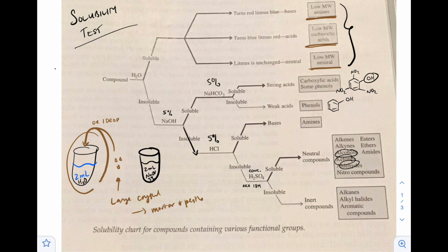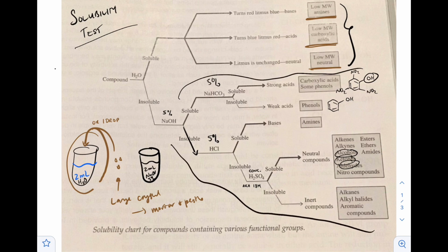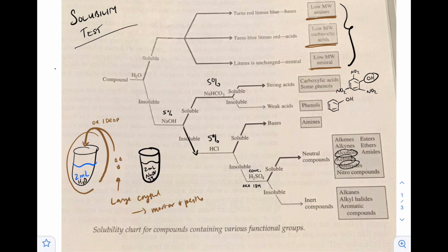I think the bulk of the information is down here, like what's going on, why do these help us identify the functional groups. And so I hope that was made clear. If you have any questions, of course, you can reach out to me. But just take detailed notes, and then when the time comes, you'll be good to go to perform these, and you're going to be pros.